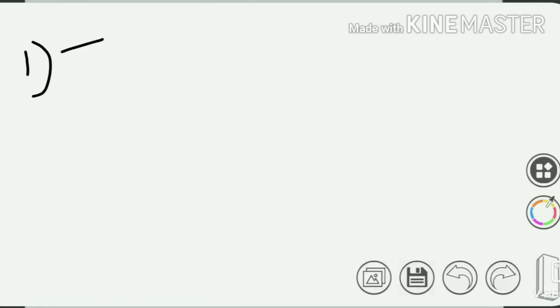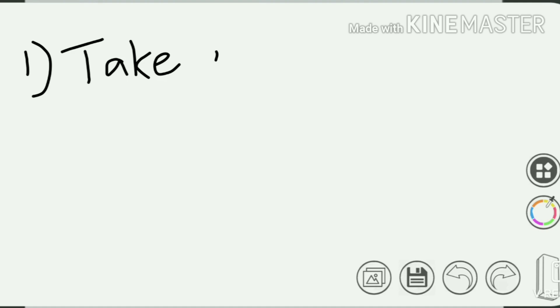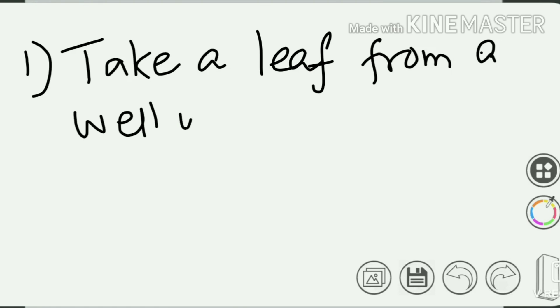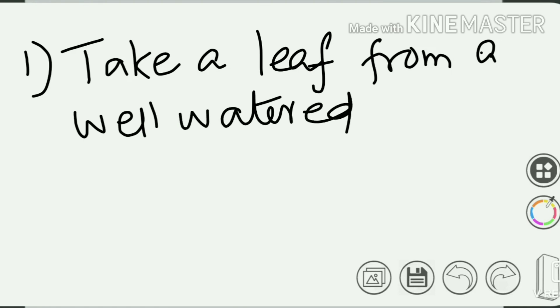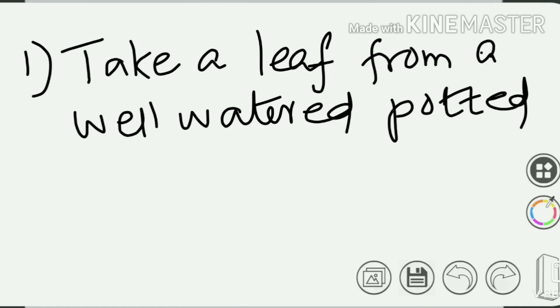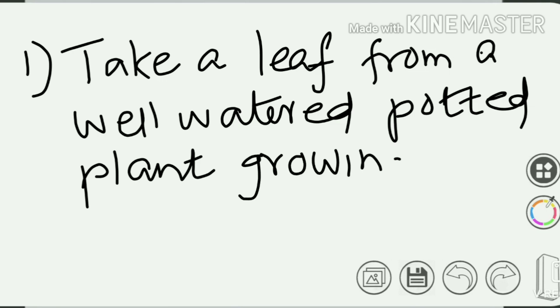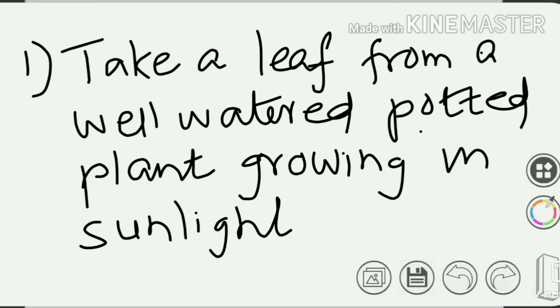The first step is to take a leaf. It should be a healthy leaf from a well-watered potted plant growing in sunlight. The plant must be exposed to sunlight. Just pluck a leaf from such a well-watered potted plant growing in sunlight.